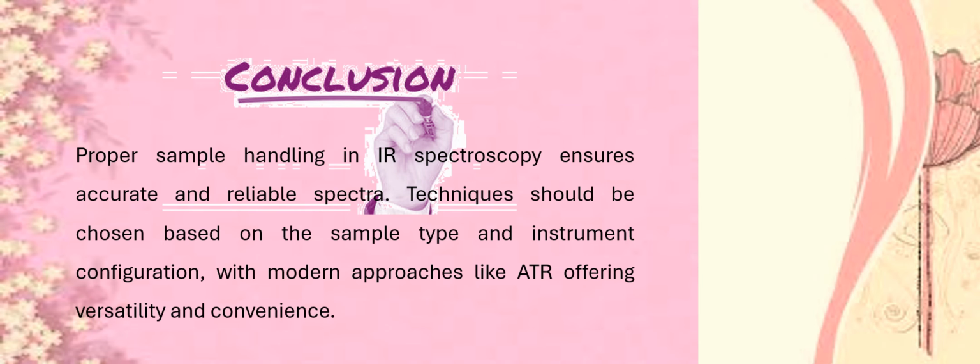In summary, proper sample handling in IR spectroscopy is essential for achieving accurate and reliable results. From traditional methods to modern techniques like ATR, you now have a toolkit for analyzing different sample types with confidence. Consistency in preparation leads to consistency in results. Practice and refine your methods.